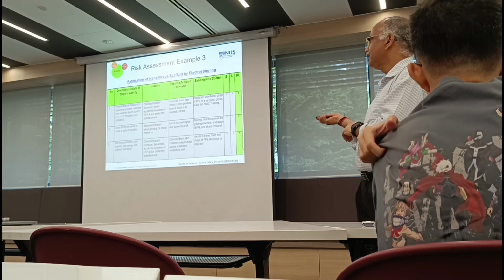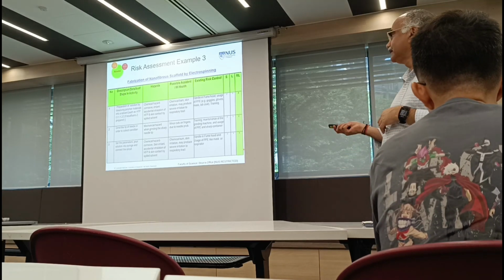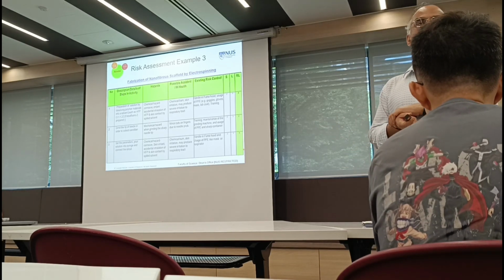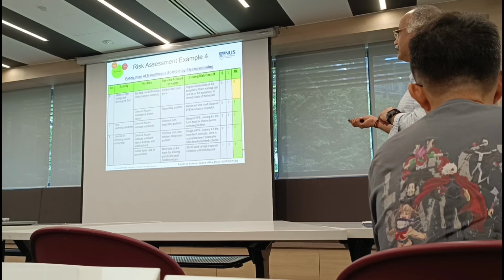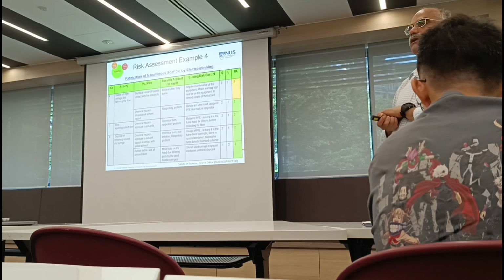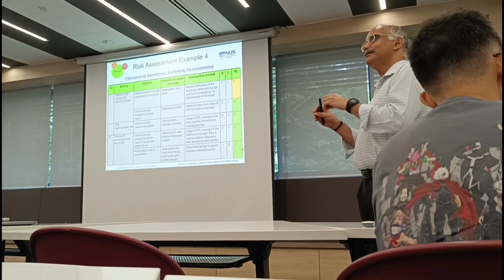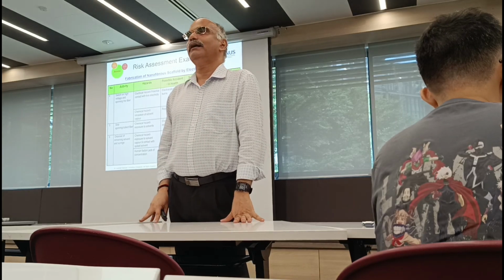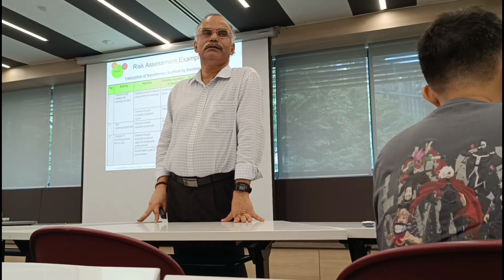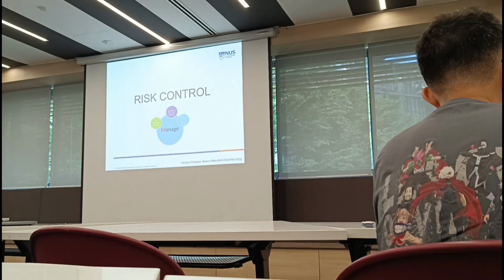These are numbers given based on the hazards associated with, based on the accidents and possible health issues associated with, right? So you need to make sure we justify what numbers we give. Don't give random numbers, that's what I'm trying to say, because auditors are specifically going to look at those. I have seen this many times with students doing it. So you should be able to explain why you give that.